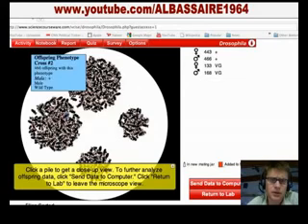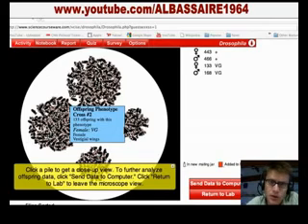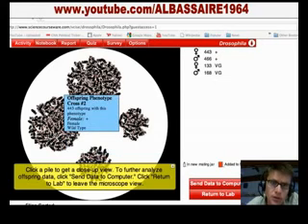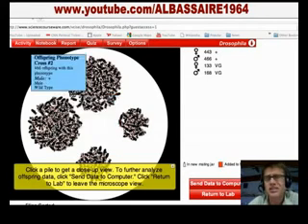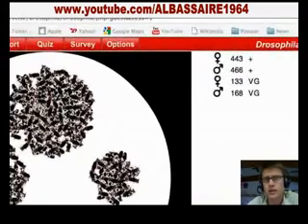And now we have different groups. In other words, it looks like we've got 466 males of the wild type, whereas we only have 133 females of vestigial, 168 males vestigial, and then 443 females of the wild type. So this is kind of looking like that 3-to-1 ratio, that Mendel cross, that famous cross. We could actually send the data at this point to the computer, and you could do chi-squared analysis. I won't talk about chi-squared analysis on here, but I'd probably do that in a different podcast.